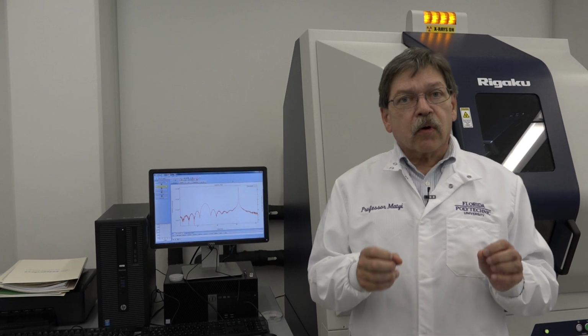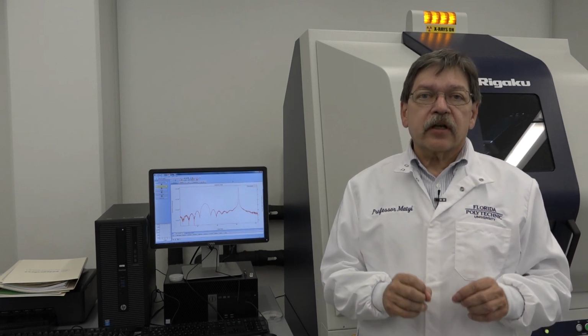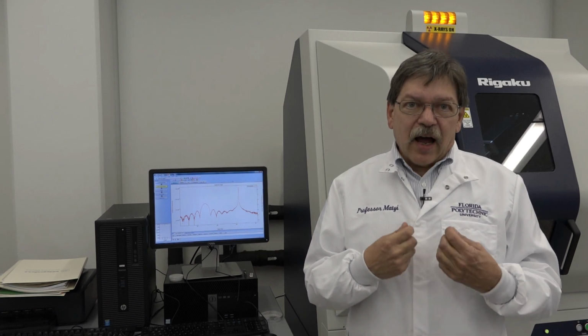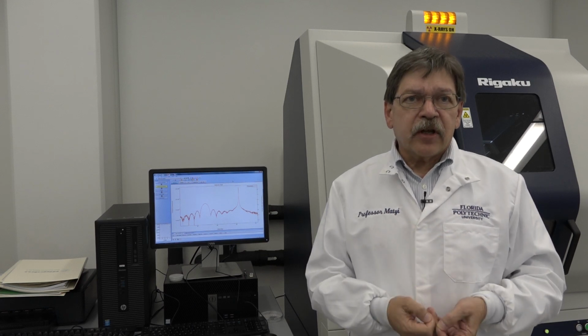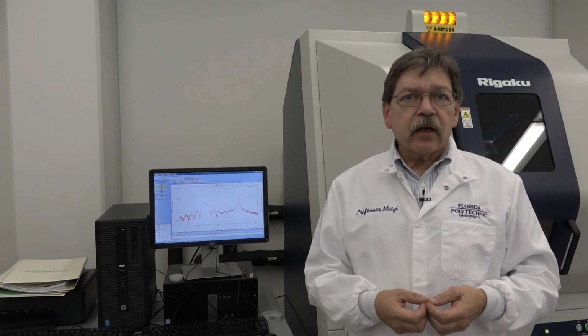Each student or pair of students is owning a specific technique, a specific capability. And what I'm tasking them to do is to develop a record that consists of the theory behind that technique, how you implement that technique, how you configure the instrument, what sort of samples you can look at, how you actually go about collecting the data, and then how you analyze the data.